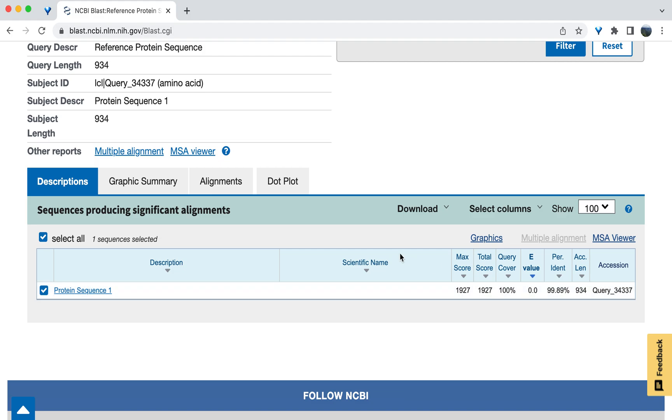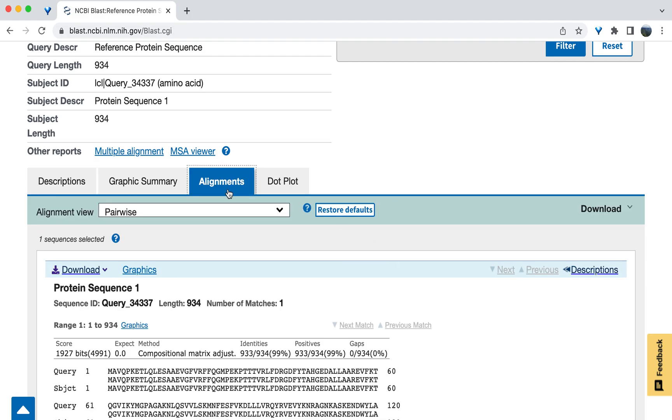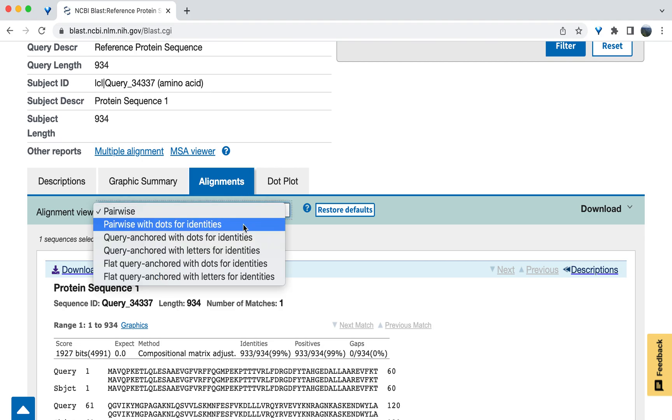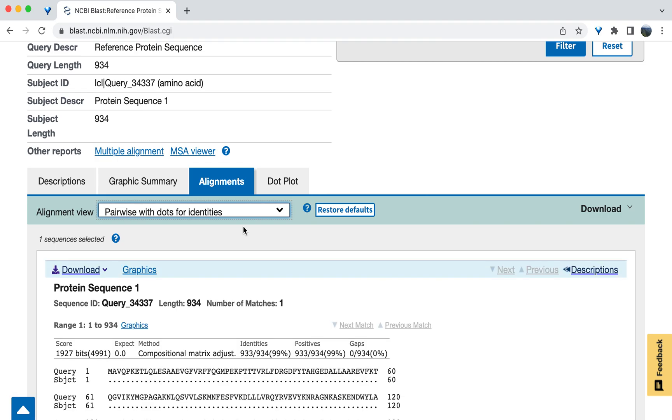Now, click the Alignments tab to see how many amino acids align between the two sequences. Change the view of the alignment to pairwise with dots for identity. This will provide a view that is easier to visualize differences between the two sequences.